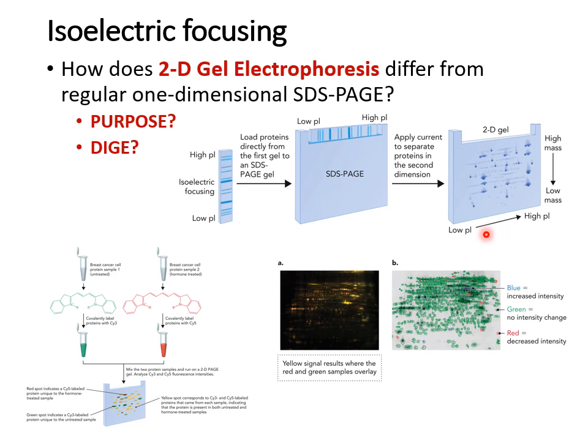Okay, we're not going to go into crazy details about the technique of this one. I just wanted you to know that it exists. It's very valuable for us because it can allow us to resolve 1,000 to 2,000 separate proteins in one gel, basically in one technique. So it gives you a lot greater resolving power than the one-dimensional gel.